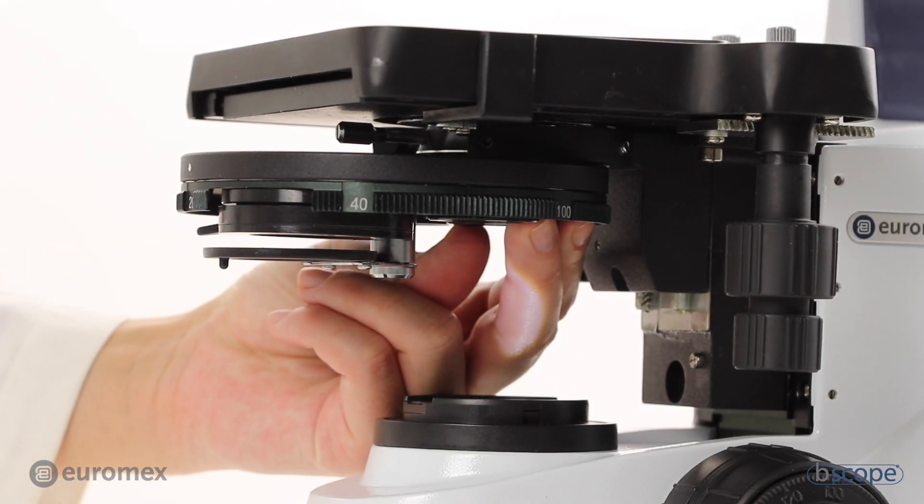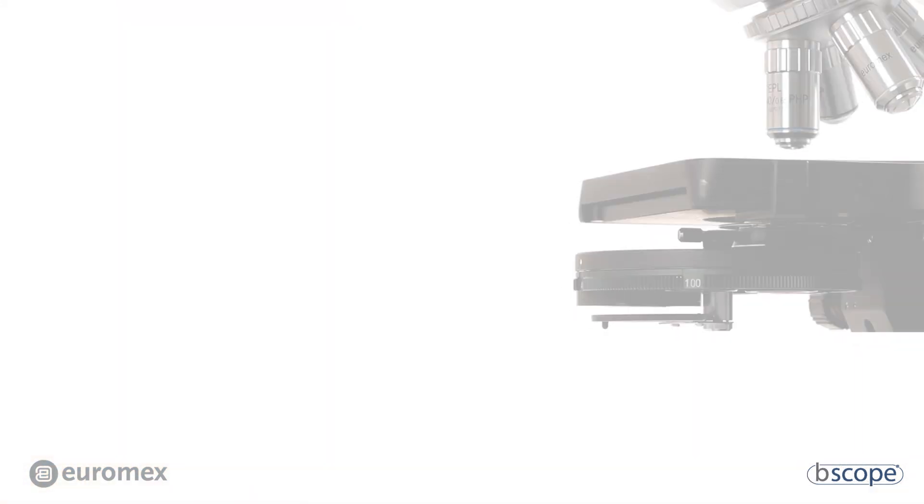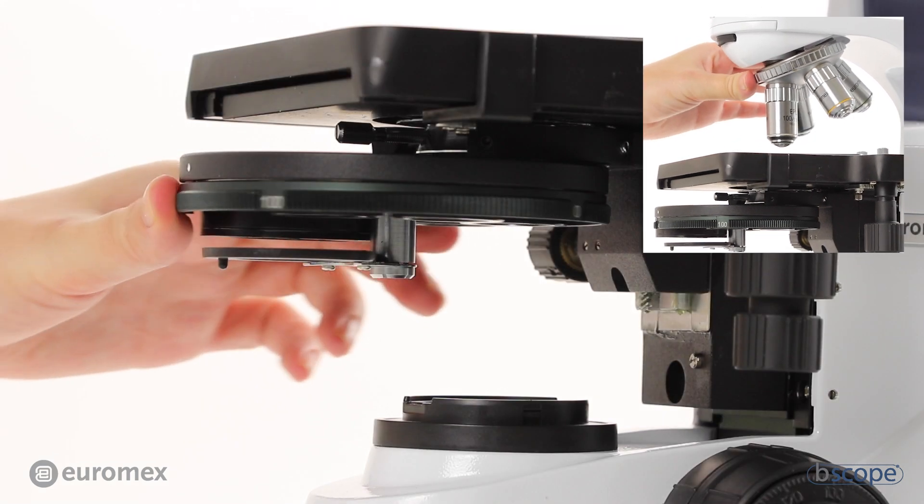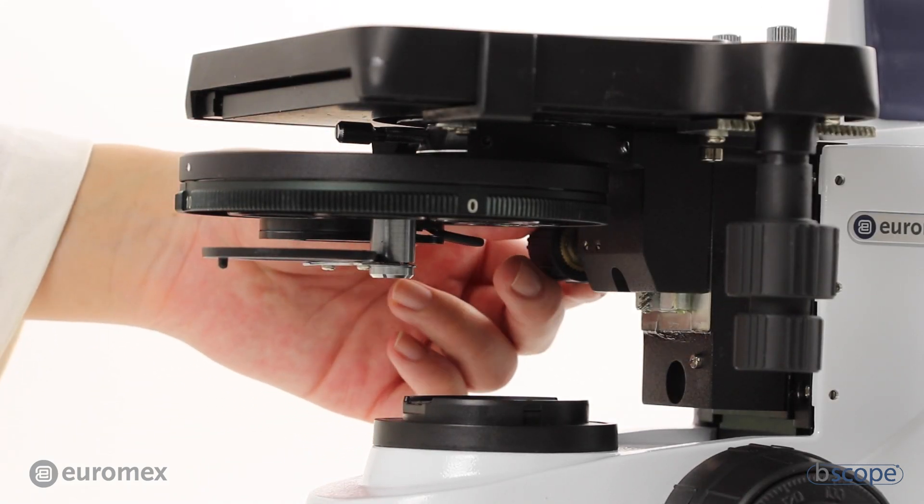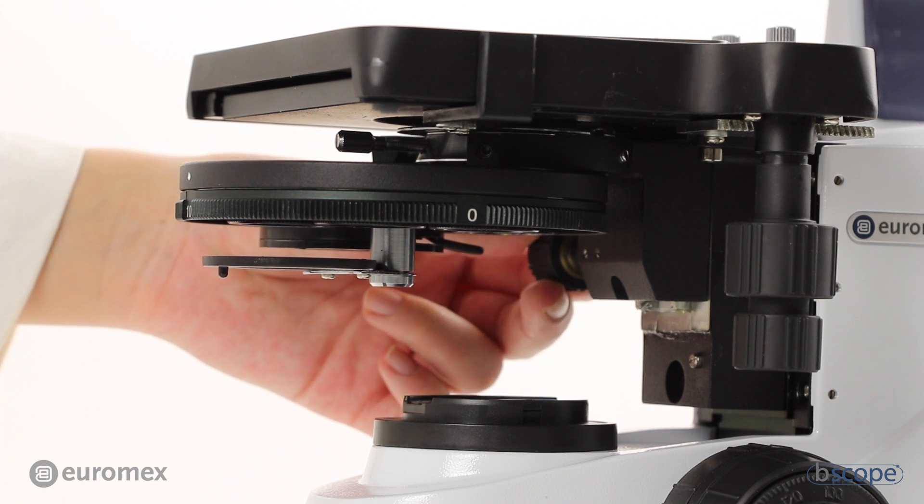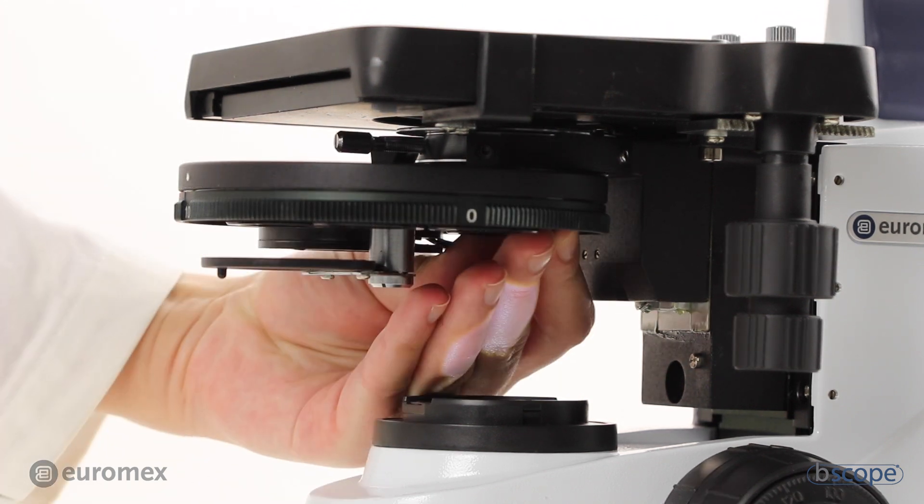Repeat process for the 40 times and 100 times objectives. To focus on the 100 times annulus, you might need to slightly lower the condenser. Center the annulus for the 100 times objective.